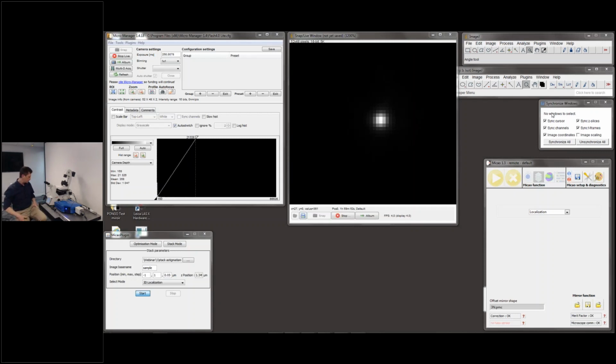Well, I will try to anyway. So welcome everybody to the hands-on part of this webinar. And thank you, Vincent, for this very nice introduction. This really simplifies my presentation here. So basically, in this part, I will try to show you what MicAO 3DSR looks like. We will try to correct aberrations on the surface of the cover slip. We will look into 3D shaping of the PSF. And as well, we will try to go deeper into the sample and see how to correct aberrations deeper in the sample and how adaptive optics can help improve the PSF.